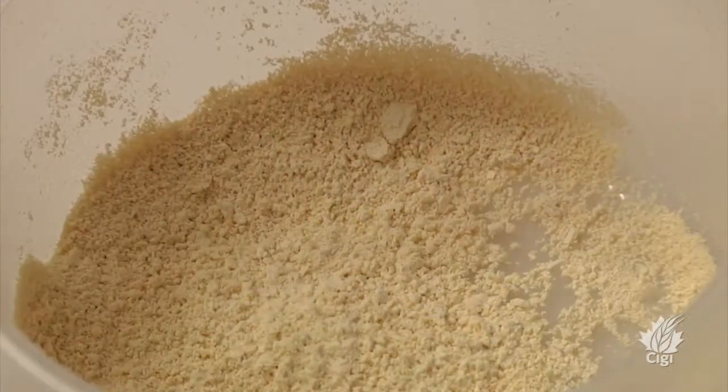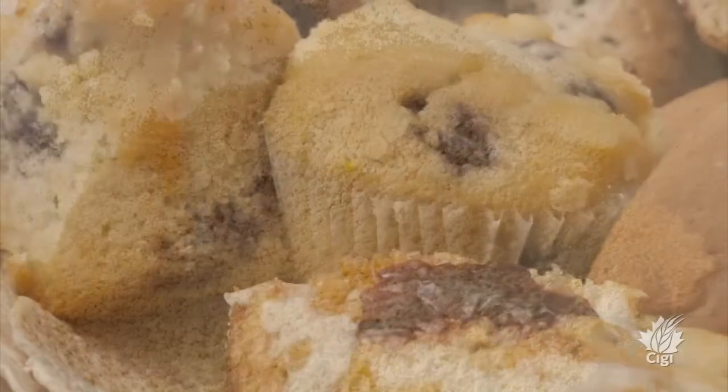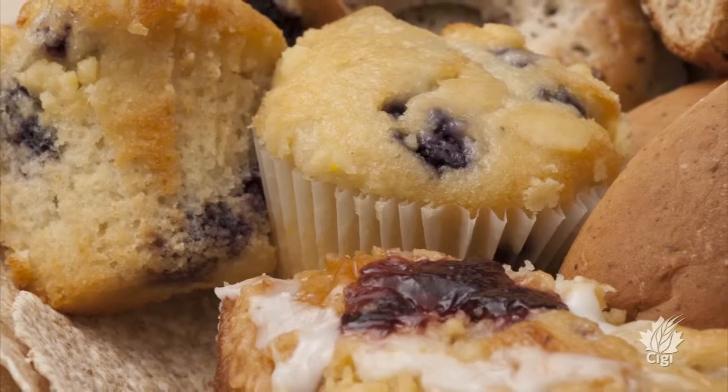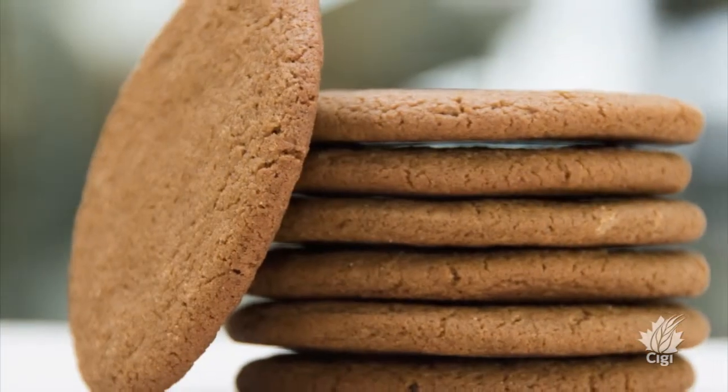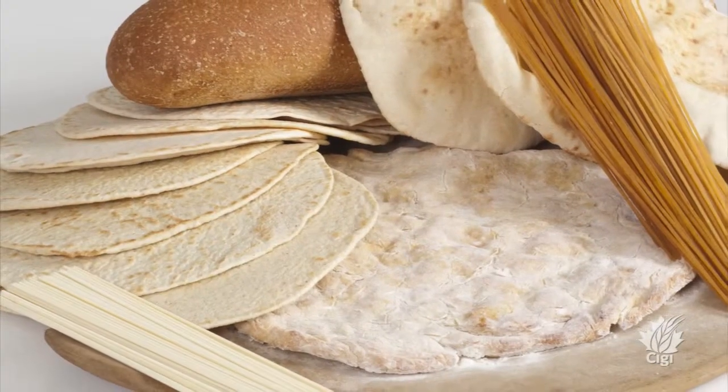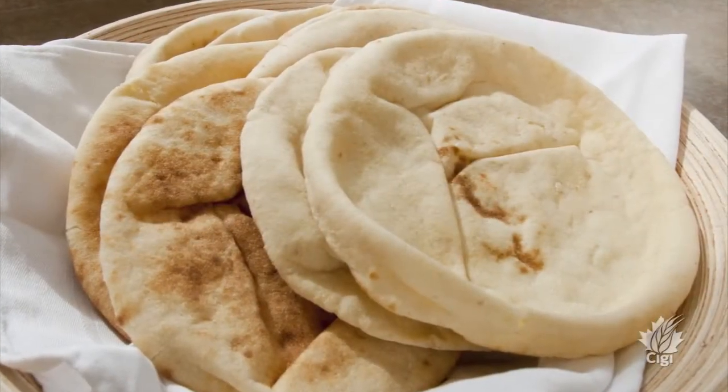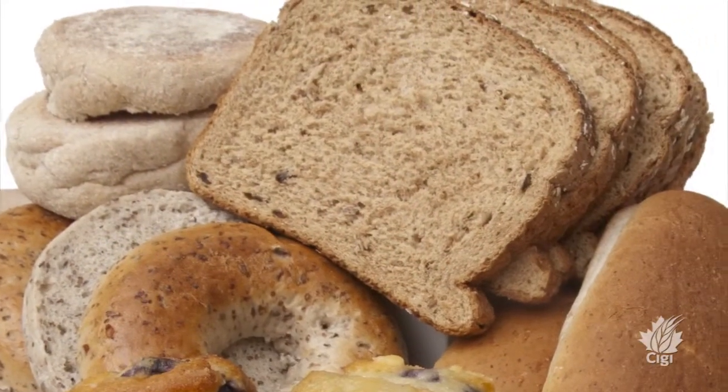Whereas the protein fraction, which is the fine fraction, could be used to increase protein in food products or even used in beverages, things like granola bars, baby foods, pastas, very popular in meat products, veggie burgers, or other baked goods.